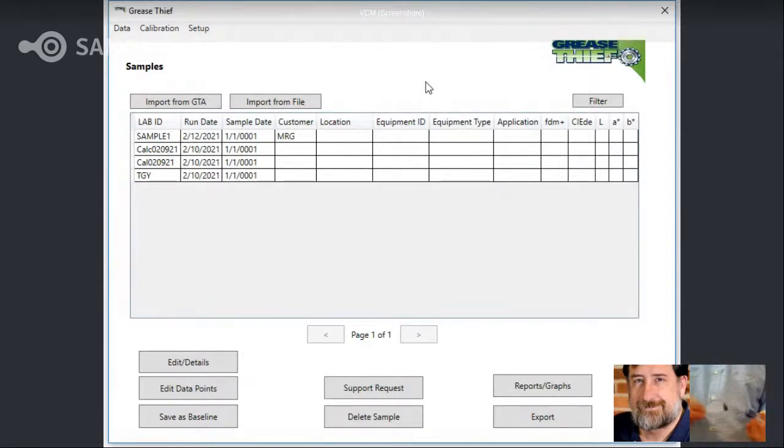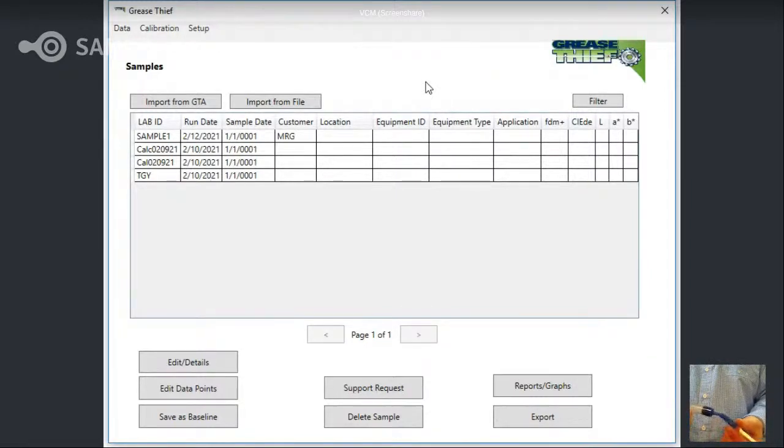Don't get grease on my fingers. So then we'll have the syringe put back in. And then as Rich said before, we want to make sure that we push together our two ends really well. And then we're going to slowly introduce that grease into the grease thief. Pushing the grease thief and the syringe together will cause the piston in the grease thief to backseat, filling the back end of the body. And then once it's full, I'll let go and just continue to squeeze and then catch the grease thief so it doesn't fall. And now the front end of the grease thief is full.